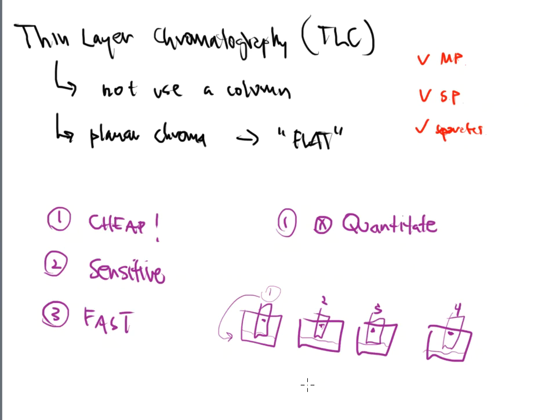Maybe in the first one I do a methanol-water mix, in the second an acetonitrile-water mix, in the third just full water, and in the fourth I might do an alcohol, who knows? But I have the easiness, if that's really a word, or convenience, I guess, of being able to develop multiple plates at the same time, and then I can pick out the right combination.